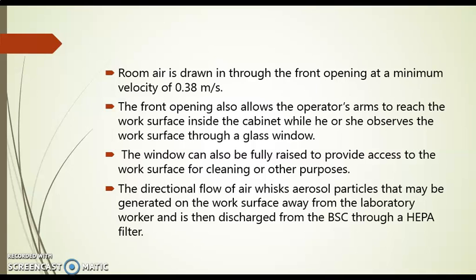The directional flow of air whisks aerosol particles that may be generated on the work surface away from the laboratory worker, and they are discharged from the biosafety cabinet through a HEPA filter, which removes the contaminated air.